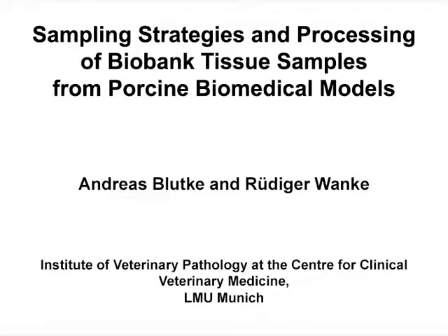This video demonstrates two key techniques for sampling and processing biobank porcine tissue specimens. The submersion technique reliably estimates total organ and tissue volume, and the orientator technique generates random isotropic tissue sections for unbiased estimation of quantitative morphological parameters.